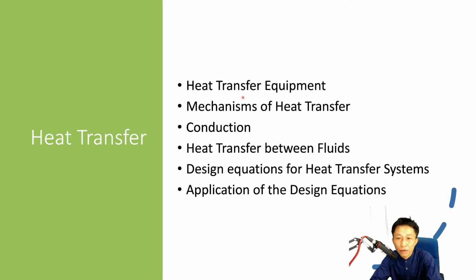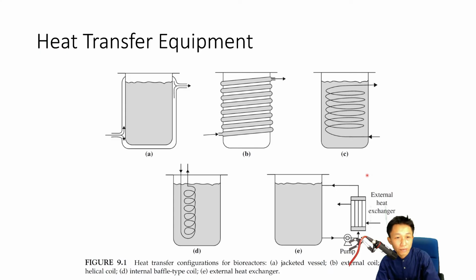theory: equipment, mechanism, conduction, convection, and other examples we use to calculate the temperature change in the bioreactor. So let's begin. This is how the heat transfer equipment is inside the bioreactor.